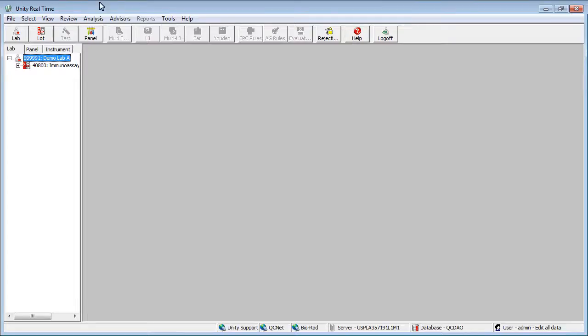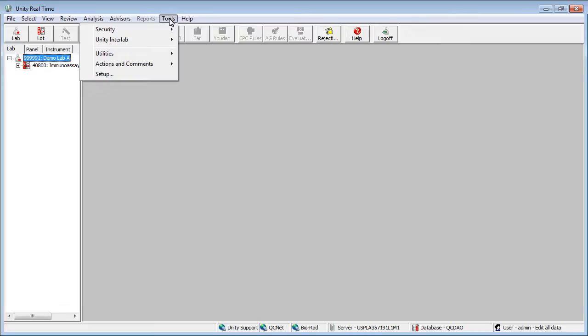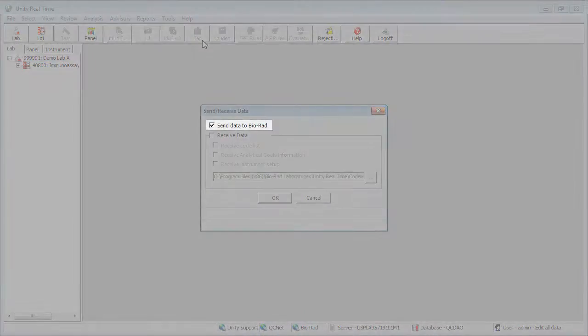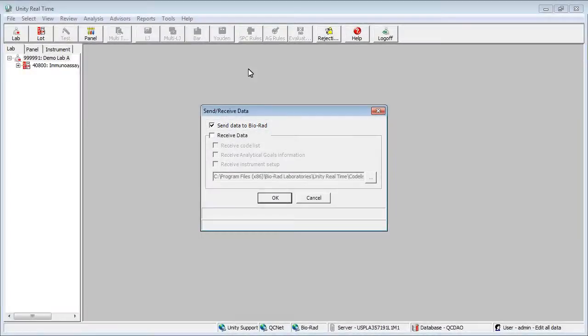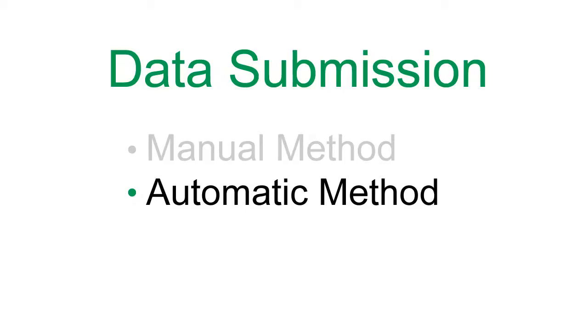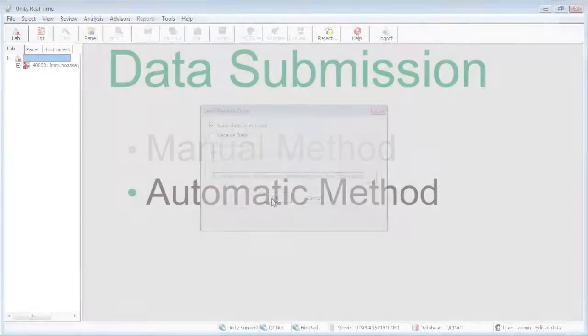When using the manual method, select Tools, Unity Interlab, Send/Receive Data, select the Send Data to BioRad checkbox, and click OK. Information about due dates can be found at www.qcnet.com. Unity Real-Time can automatically submit your data.